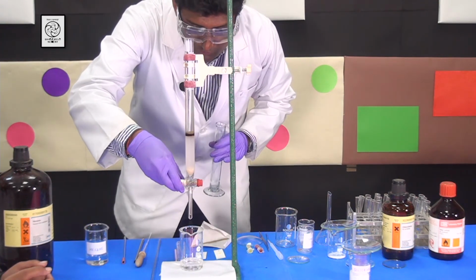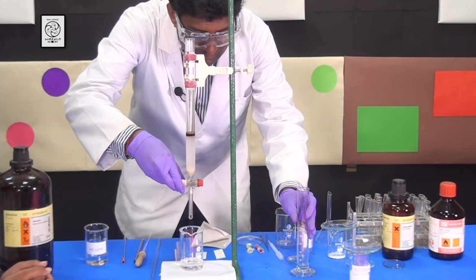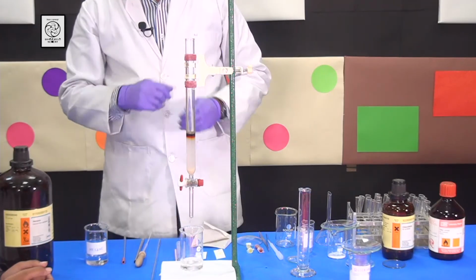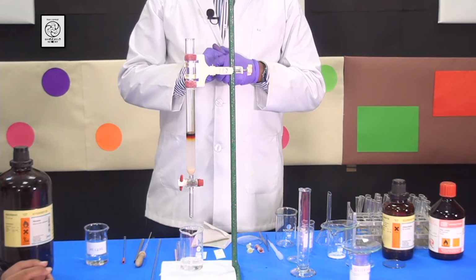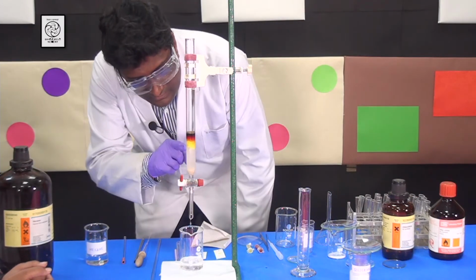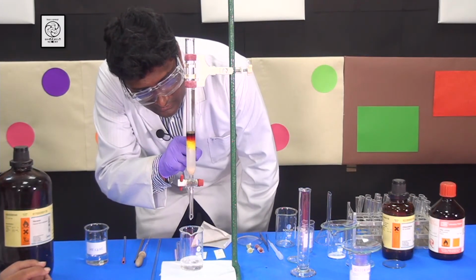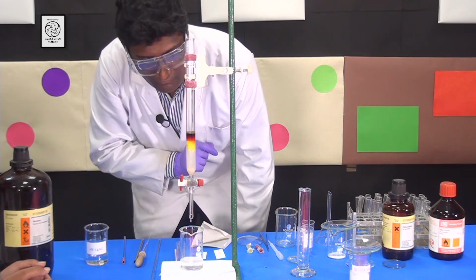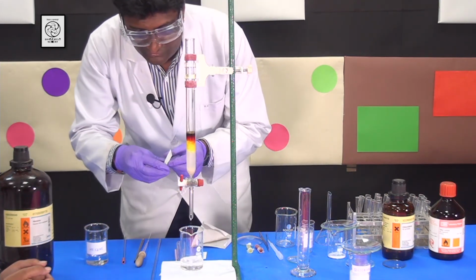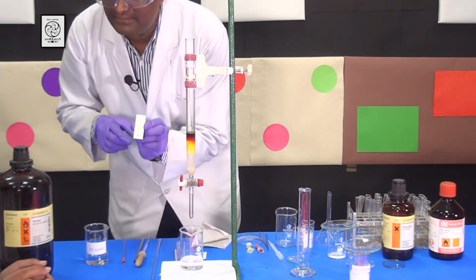Now I am going to release the stopcock so that you will have enough speed and the compounds will be eluted nicely. You can see that the yellow compound is actually coming first, like the way that you saw it on the TLC.